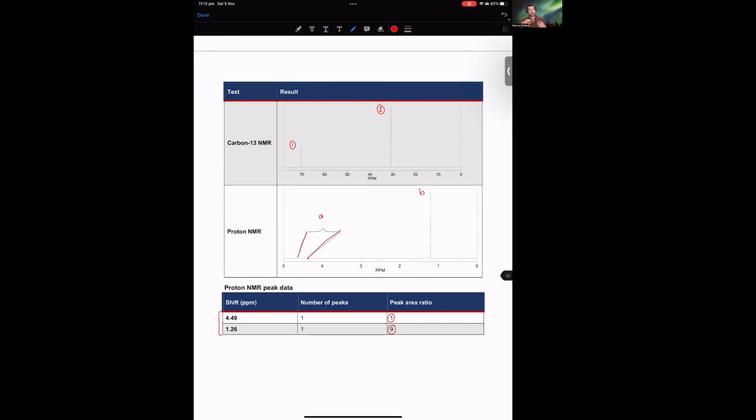Now, what's coming to mind for me here is that if there's only one proton, then it's potentially an alcohol present. We've already seen that there's a de-shielding effect. There's only one proton there. And since there are 9 protons in the other environment, and we know we can't have a carbon with 9 protons on it, this is maybe suggesting to me that there are maybe 3 terminal CH3s coming off a carbon with an alcohol. Now, first thoughts, we have to, of course, confirm this.